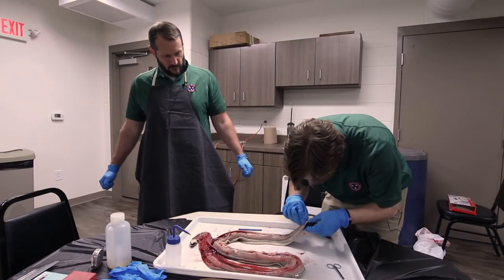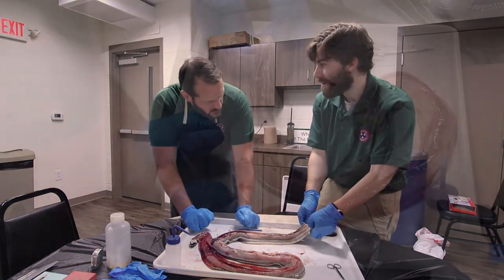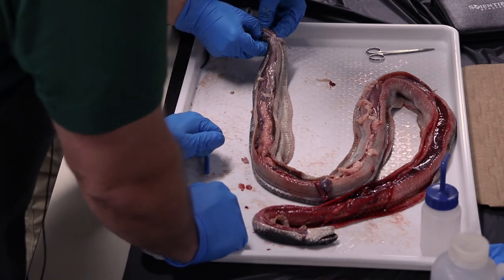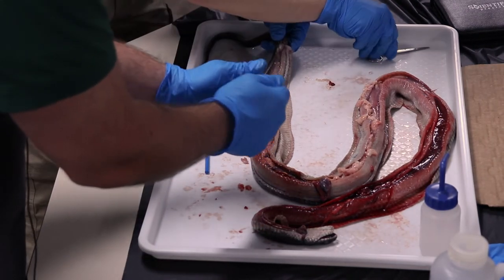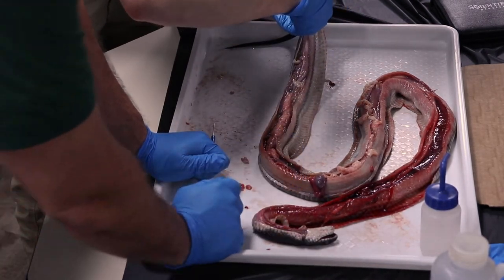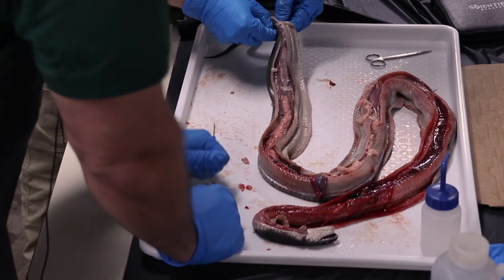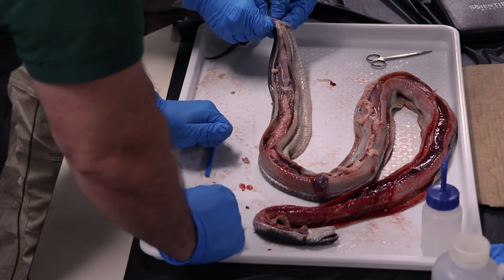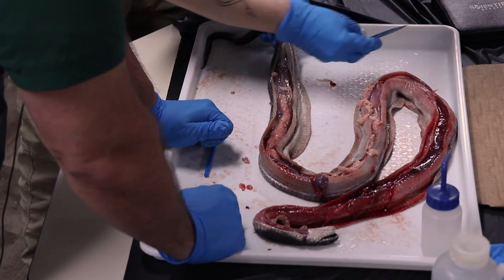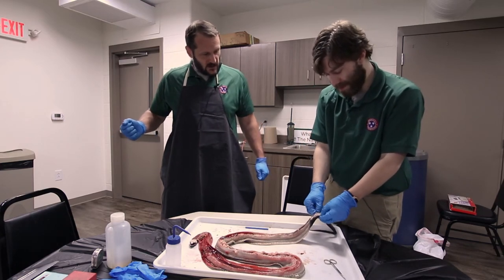Do you have an idea of how, if this is a female, how would you know for sure? Well, what's interesting, by looking at that, I can't tell straight away. The only time I've ever seen anybody sex a snake was on a live one. And they just sort of push with their thumb. And if it's male, the hemipenes just kind of pop out. You can probe a snake and figure out if it's male or female, but I'm not sure how it's actually done. There's nothing jumping out, so. And the rest of the tail is just basically just meat. Yep, it's just meat and bones, right?